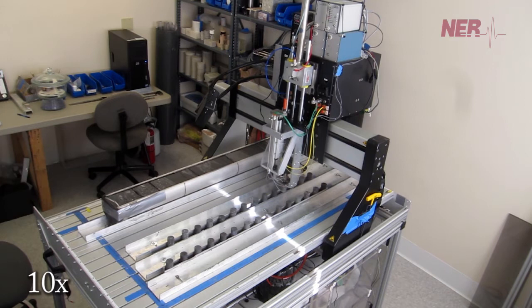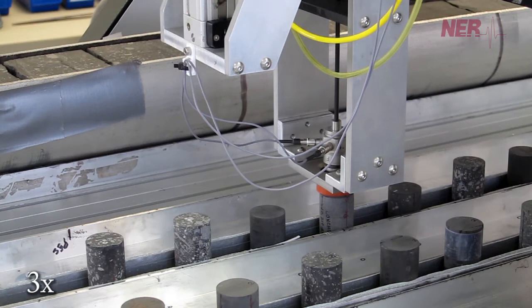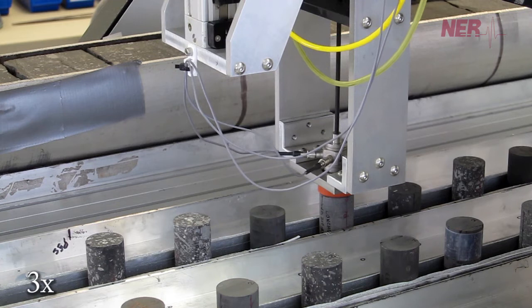Measurements can be made on sample plugs or on slab core. Many plugs can be placed on the AutoScan at one time, providing a platform for rapid, non-destructive characterization of plugs.